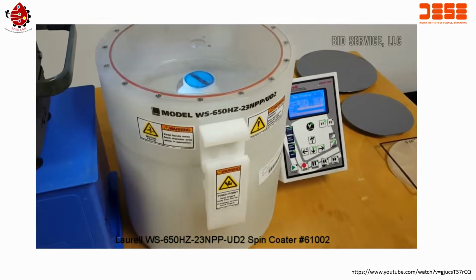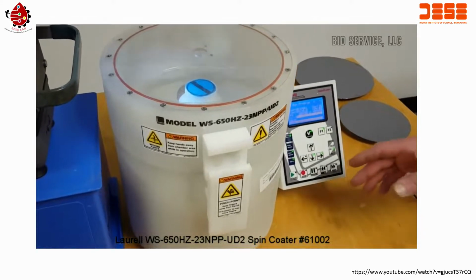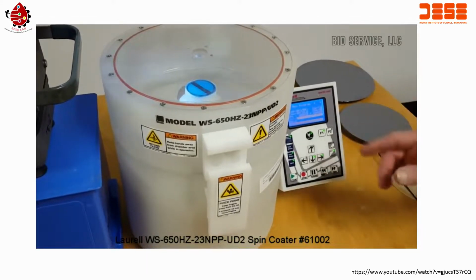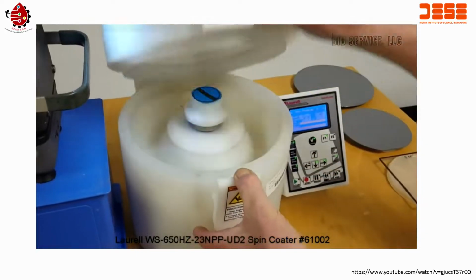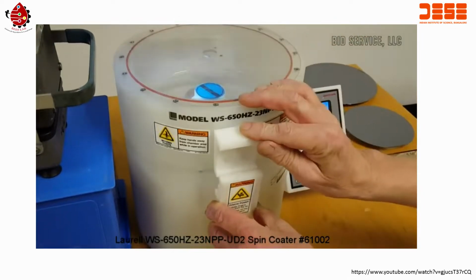Okay, when it's done, in order to go on and run another program or any other process, you must open the lid. This signals it that it's ready for another run.